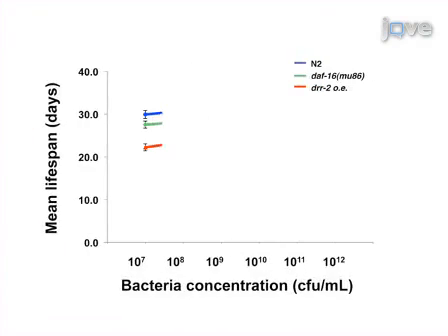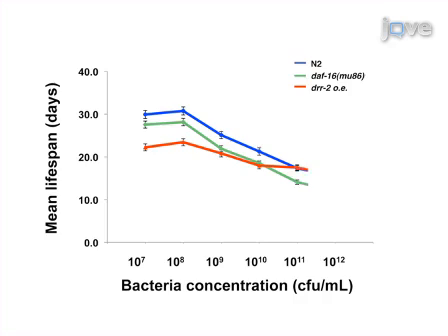Results of progeny production and lifespan measurements can show delayed and reduced progeny production as well as increased mean lifespan. The main advantage of this technique over existing methods, like dietary restriction in axenic medium, is that all the experiments will be done on a standard solid agar-based plate that is used by most worm laboratories.